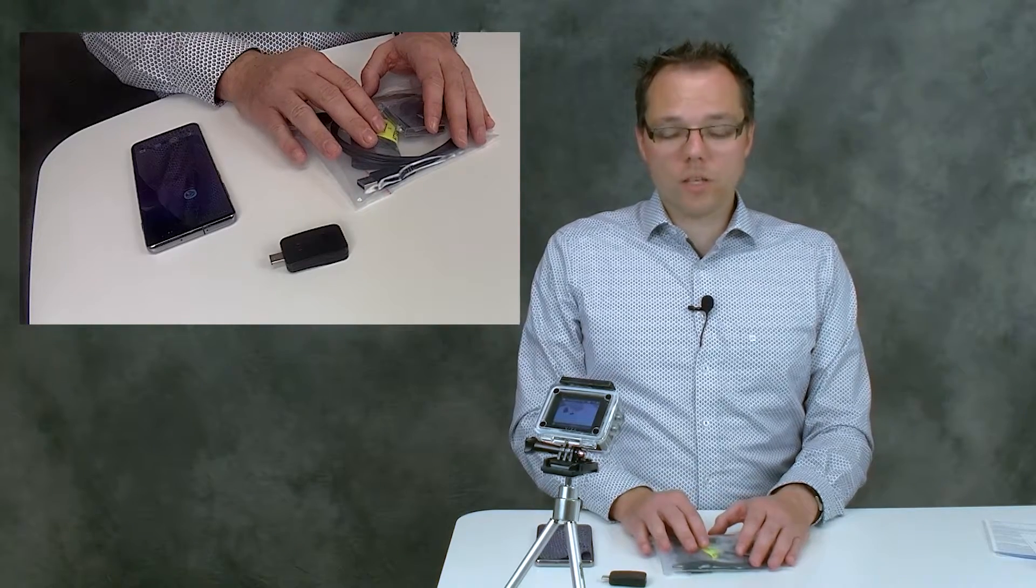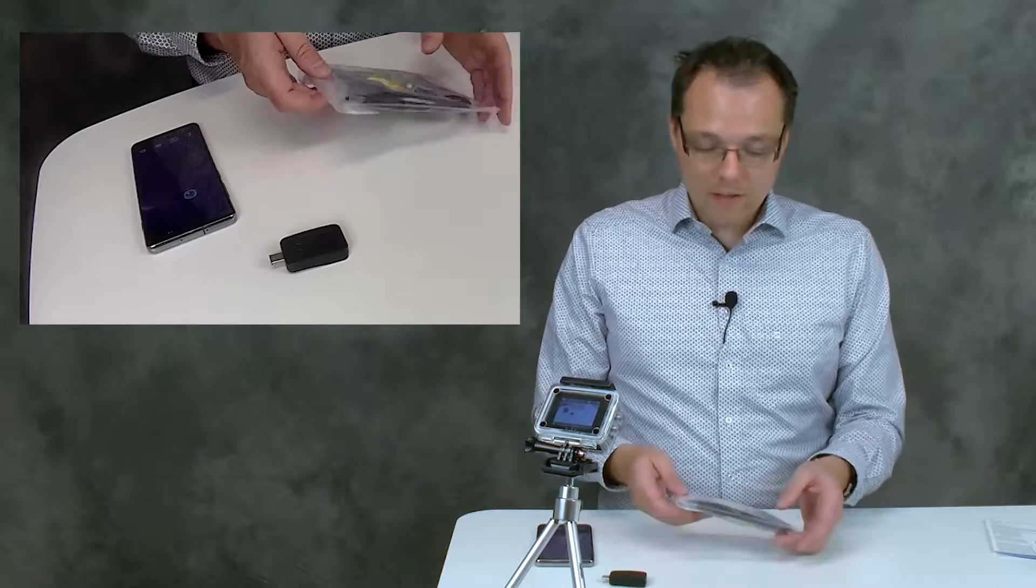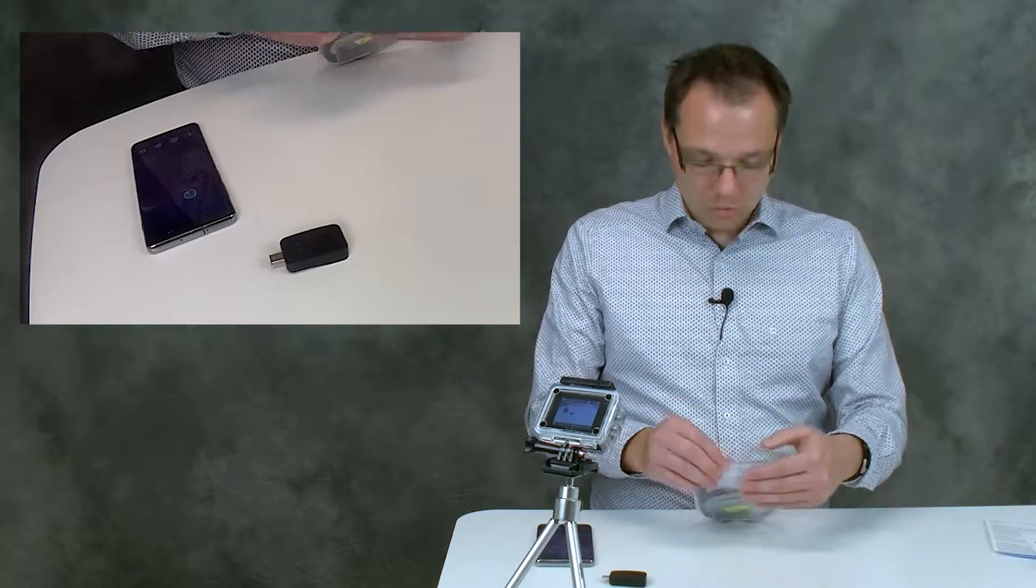But today we're going to do our first measurement with PS Touch, which is our Android app that you can download for free on the Google Play Store.